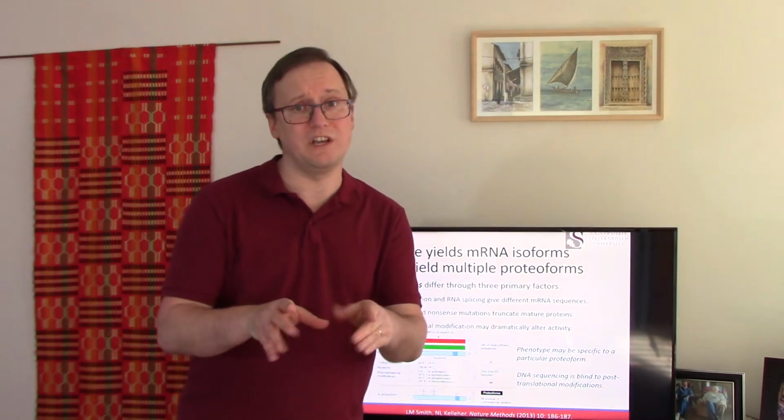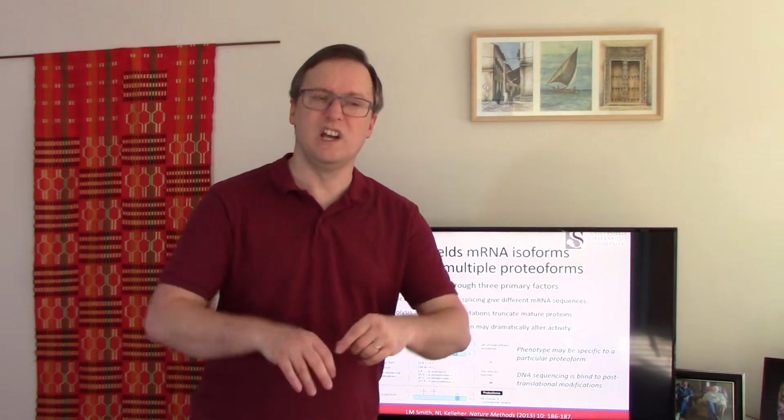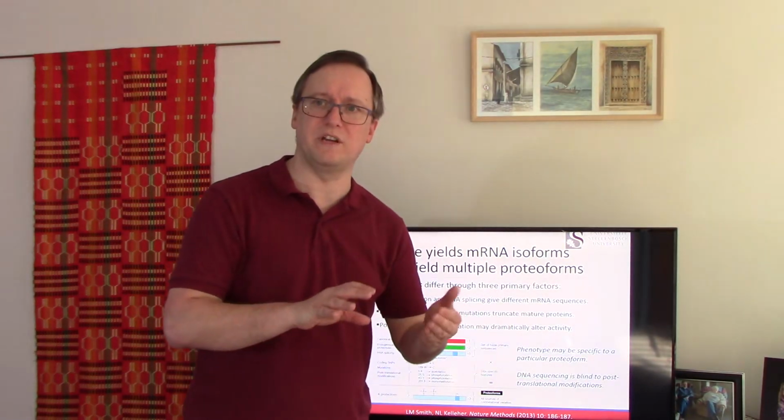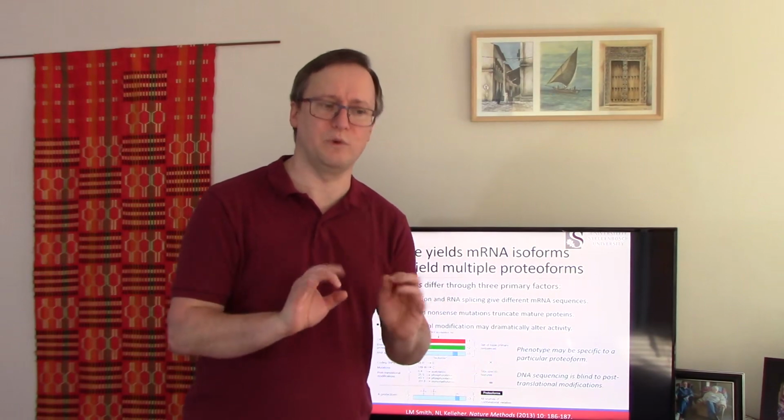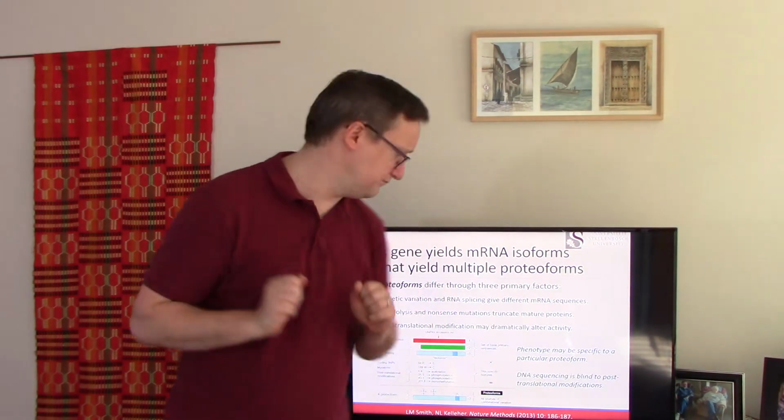If you haven't had the chance yet, we've recorded a lecture on post-translational modification identification. It's really canted at shotgun proteomics. So this lecture is going to spend more time on the issue of how we deal with finding PTMs in the context of an entire protein at once.